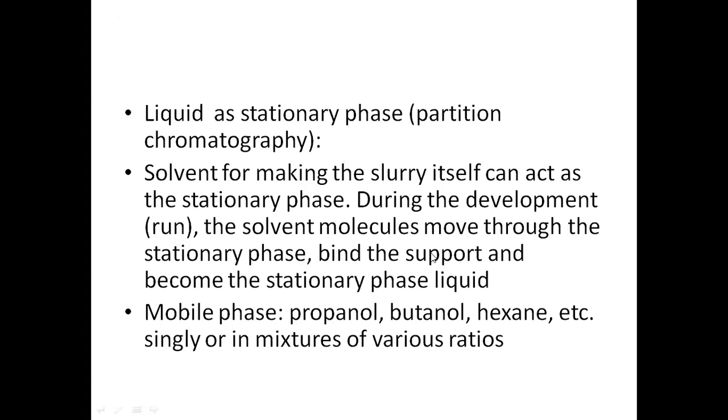Then sometimes we can also use a liquid as a stationary phase. Just as we have seen in the case of paper chromatography, we have seen that water itself is the stationary phase. So here also we can make use of that. Even water can be allowed to function as the stationary phase in TLC. But usual applications of TLC all make use of solid material as the stationary phase. Okay.